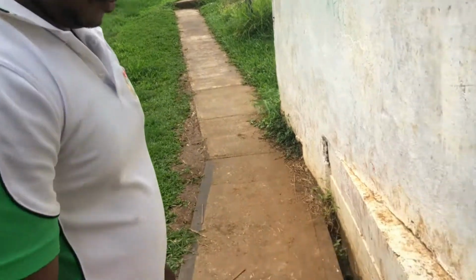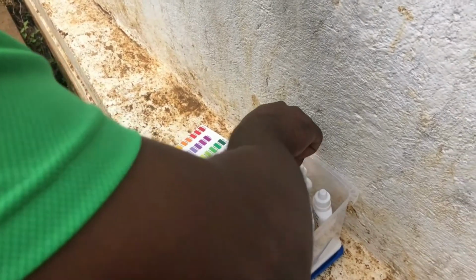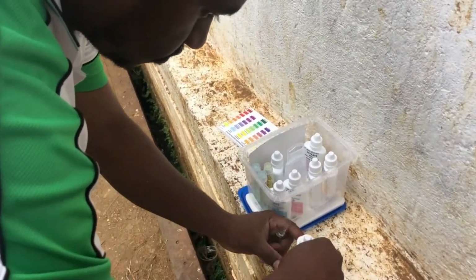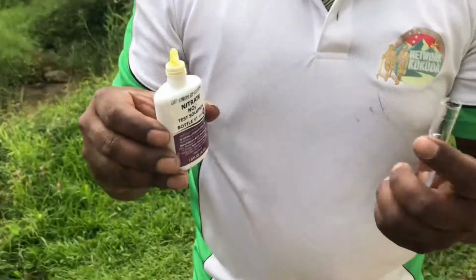Test 4, nitrate. Nitrate is the final stage of the nitrogen cycle. Nitrate is not toxic to fish, but high levels can act as a fertilizer and cause algal blooms. Add 10 drops of nitrate solution 1.